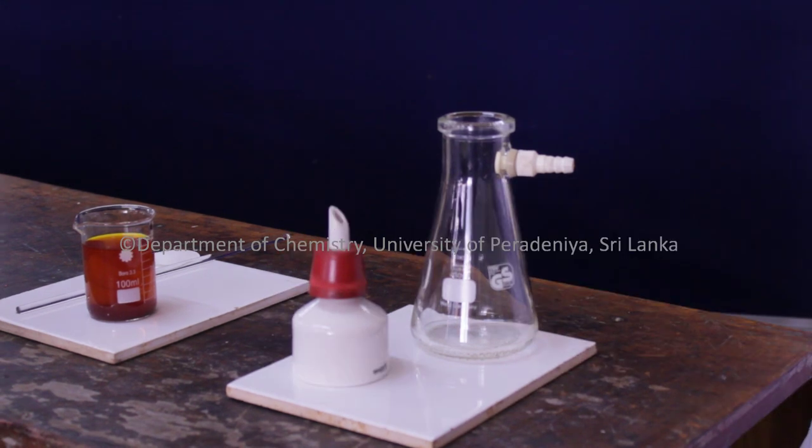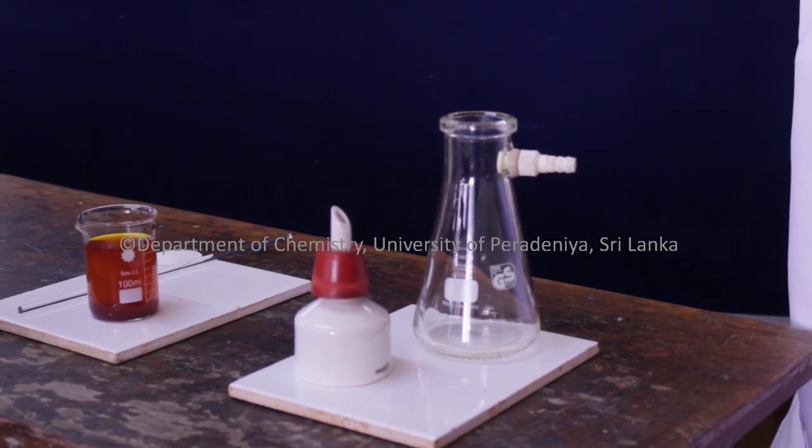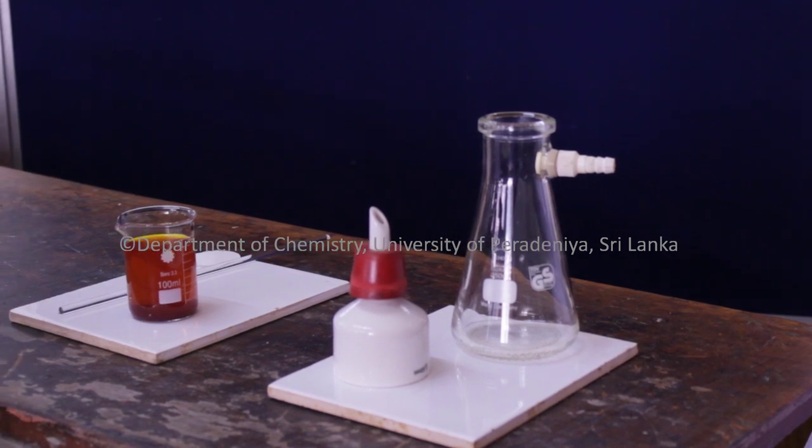As mentioned before, this Buchner funnel is mainly used to speed up the filtration process and get the solid product separately. As an example, most of the recrystallized compounds are collected using these kinds of Buchner funnels.